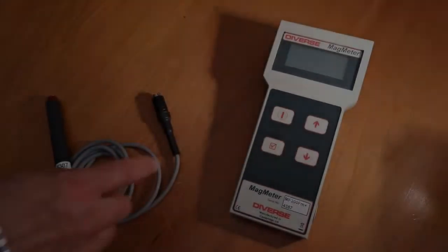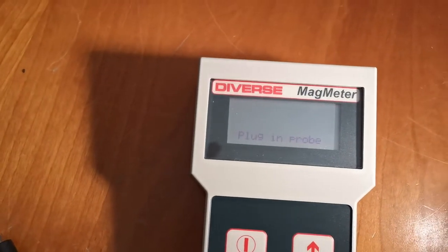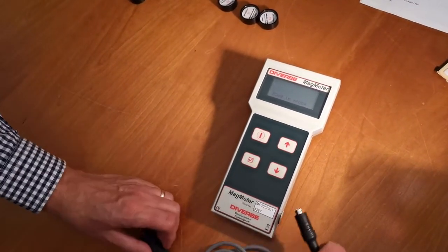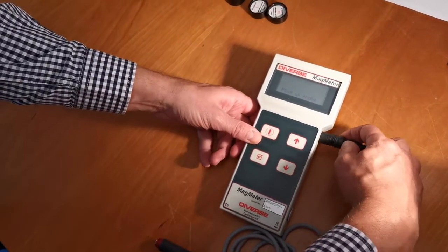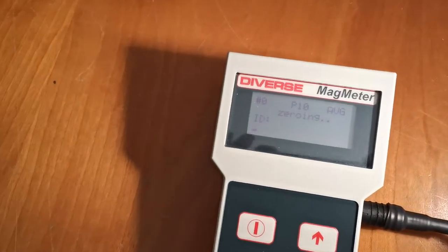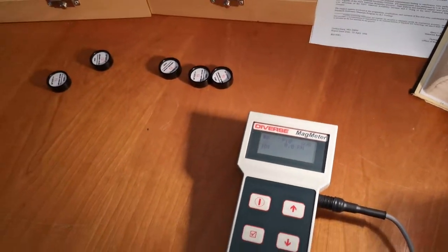Let's see the ferrite meter in action, starting with the P10 probe. The computer controlled meter undertakes self-test at switch-on. It has spotted that no probe is connected, so our next step is to plug in the P10 probe. The meter has now detected the P10 probe, zeroed the instrument and is ready for action.